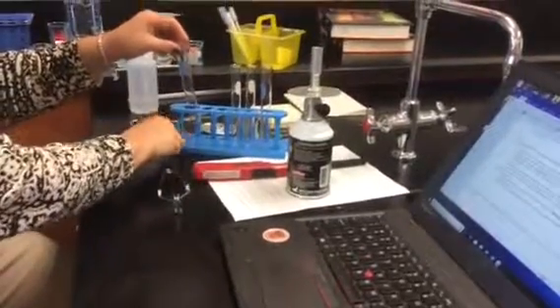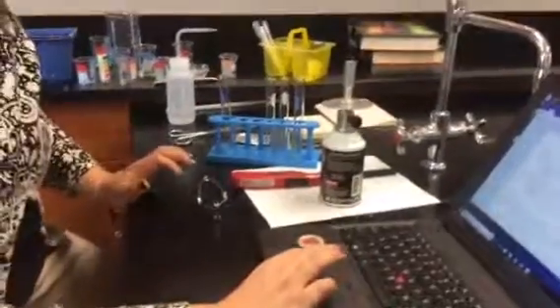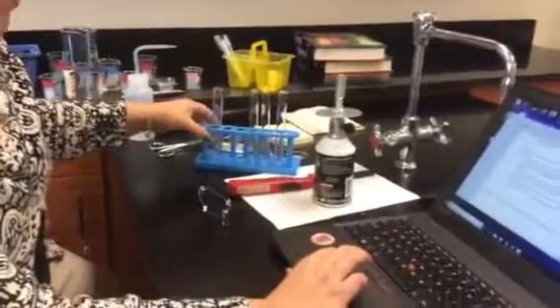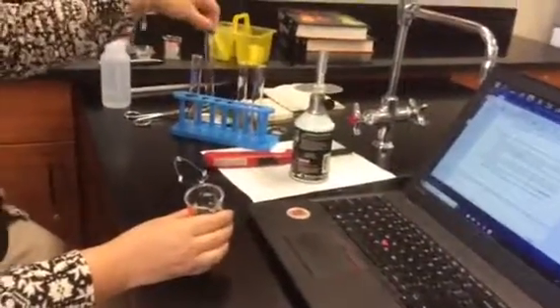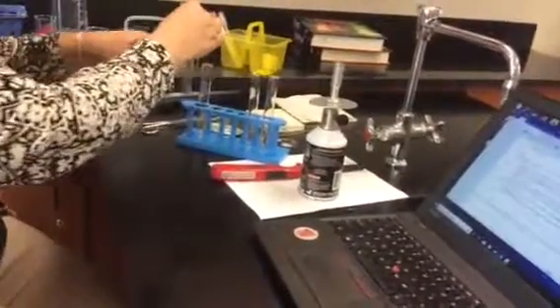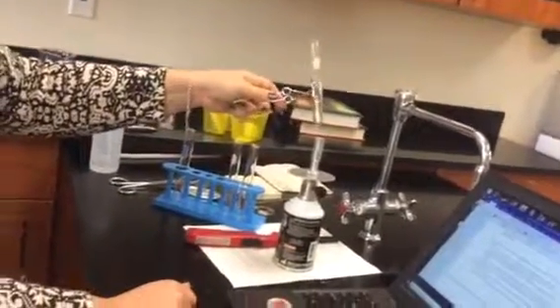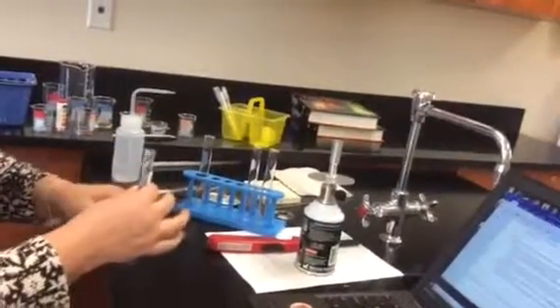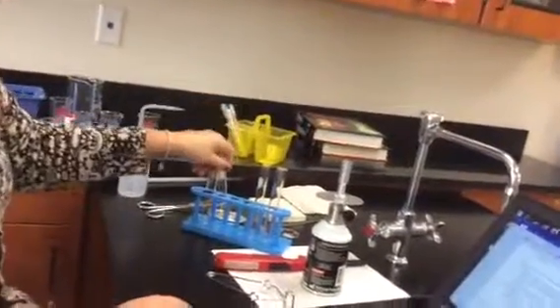Alright, we just don't want that sticking in there. Okay. And then when you return to it, you're going to put water back on this, just a little bit of distilled water. Alright, place a small amount of copper carbonate. So that's this one, powdery. Again, using your scopula, put it in here. And then again, you're going to heat it up, keeping it away from your face and your partner's face. Even I wanted to look down the test tube and see what was inside, but I can't do that, so I won't.